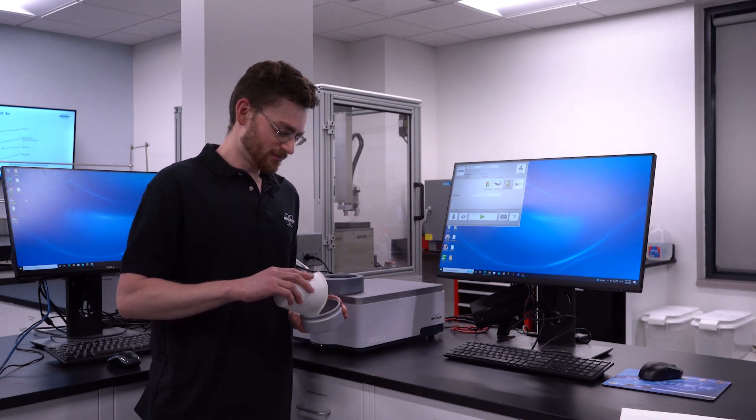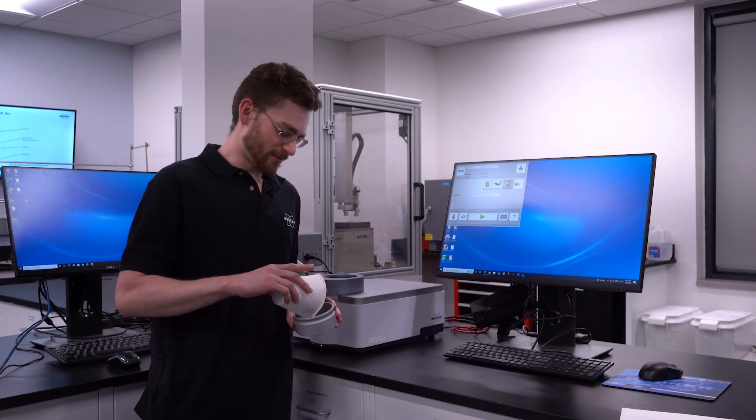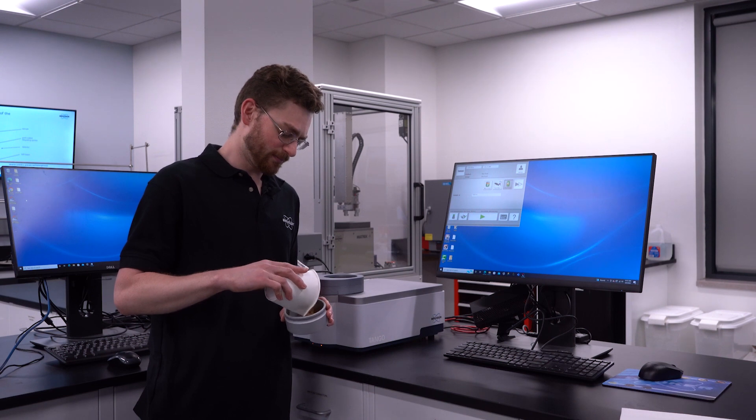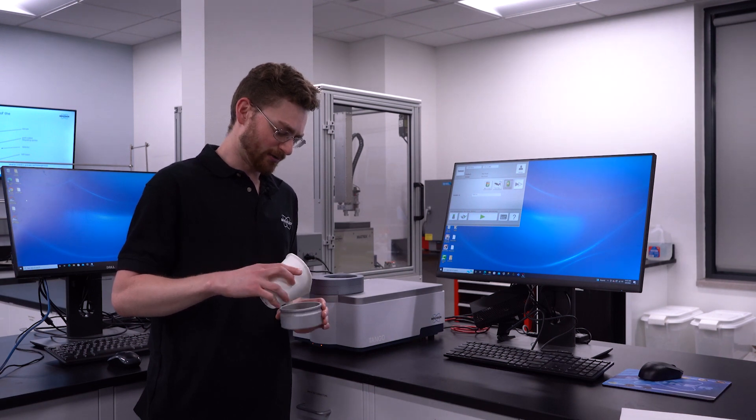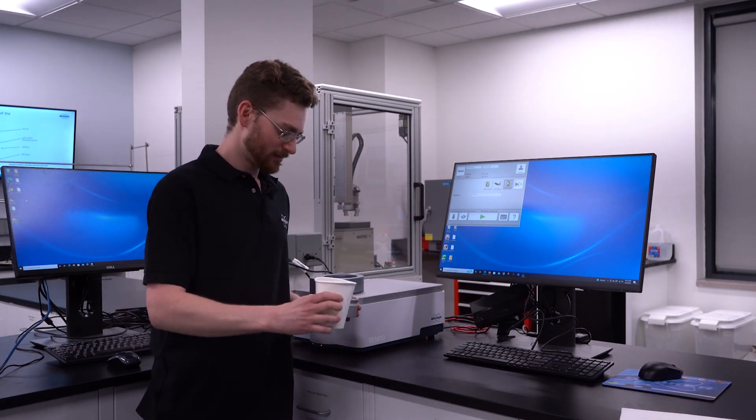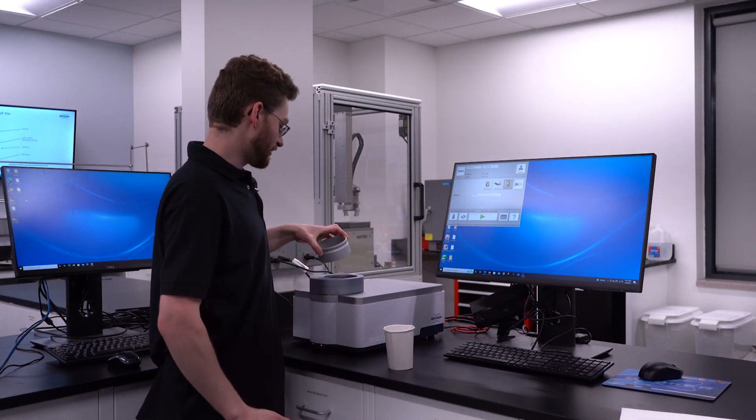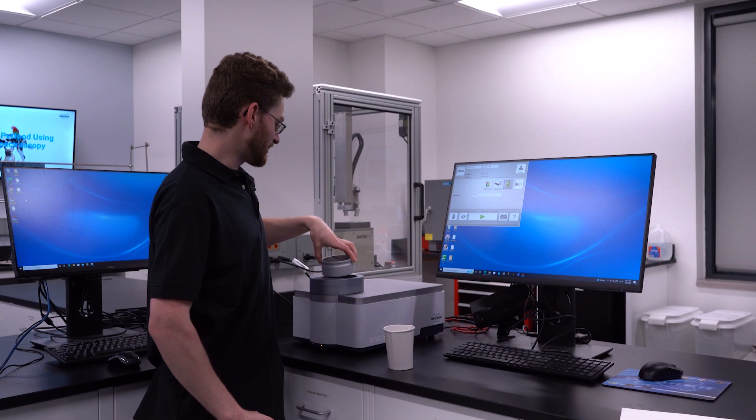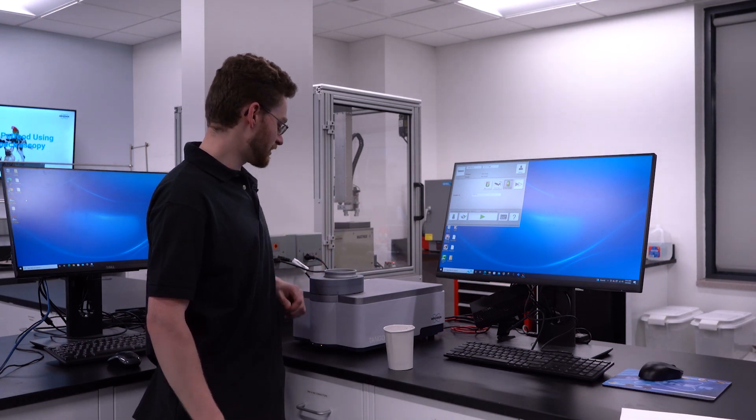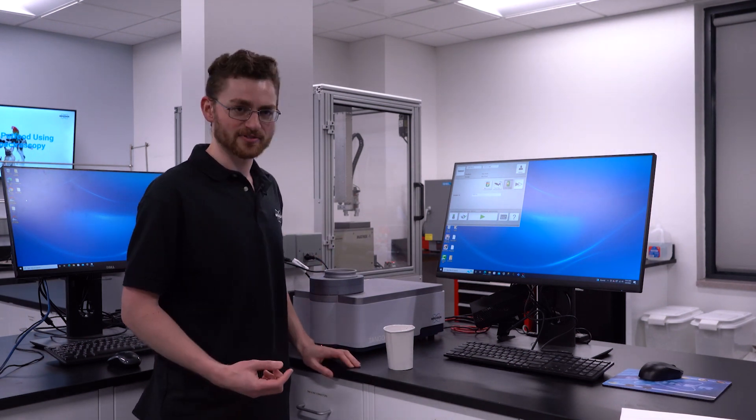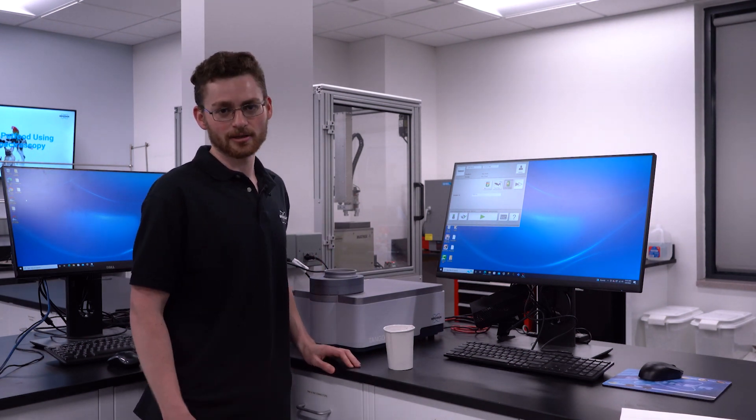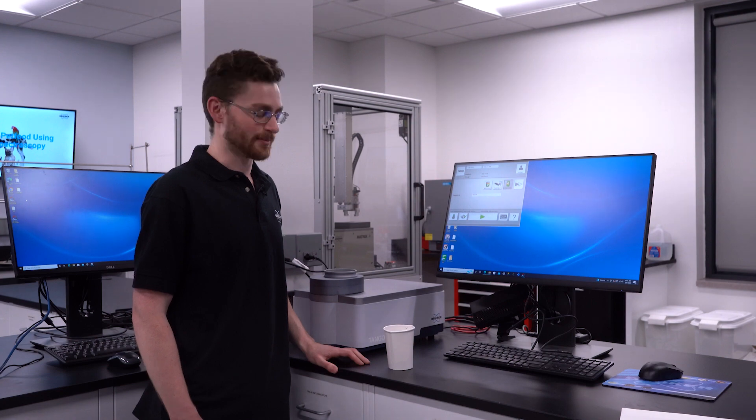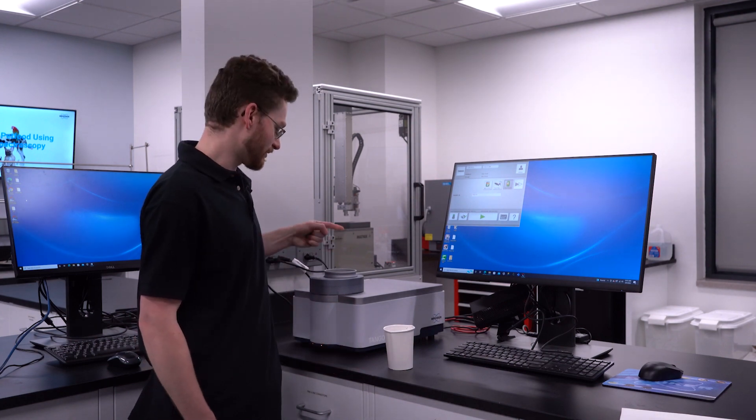To measure the pet food, we recommend to fill up the cup about halfway and you don't need to level or pack it because our light comes from the bottom. Many other instruments on the market have light coming from the top or the side.